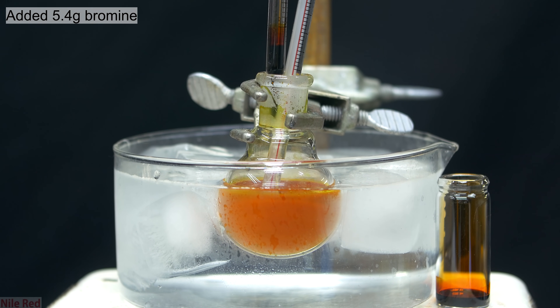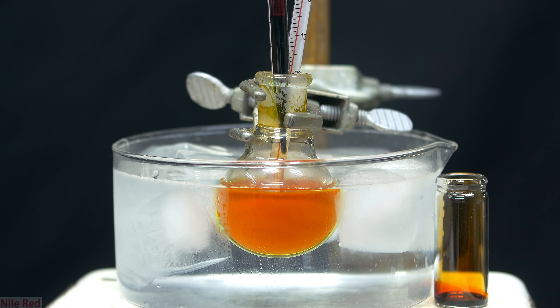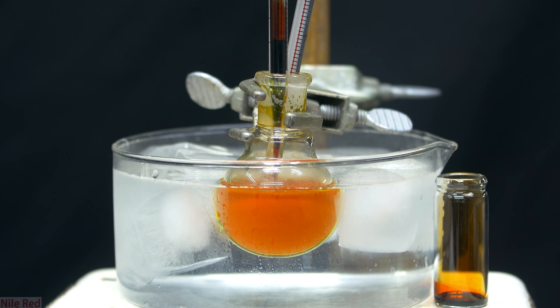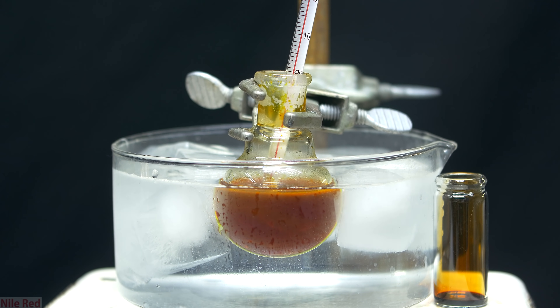The next thing we need to do is add 5.4g of bromine, and I did this in two separate portions of 2.7g. I add the bromine slowly and semi-dropwise, but honestly I probably could have just dumped everything in all at once. Before we add any bromine, we effectively just have a suspension of fluorescein and ethanol, but as we continue to add bromine, things will start to dissolve.